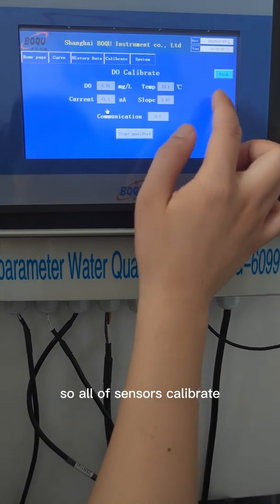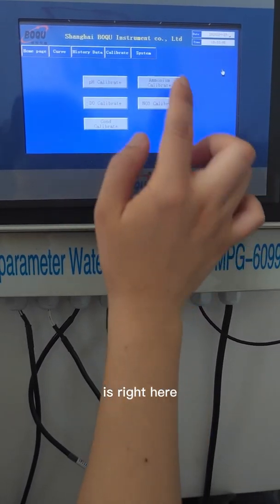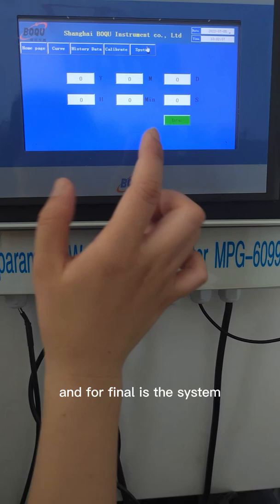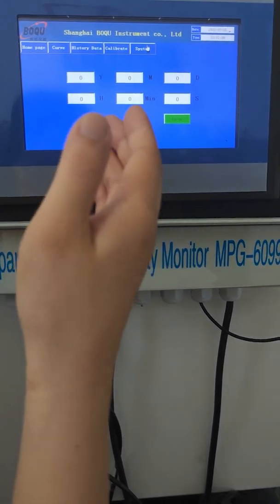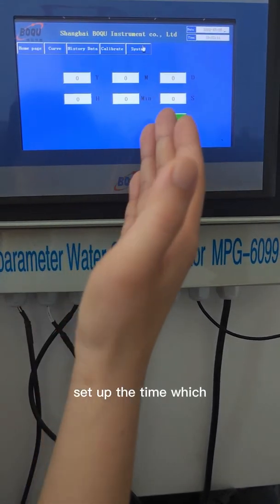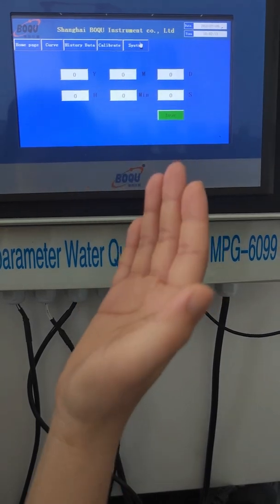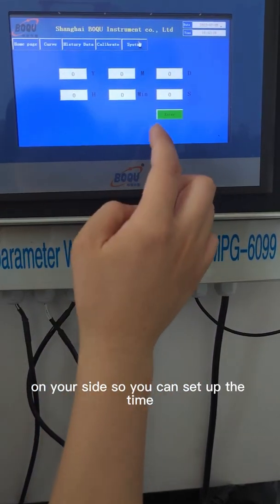For the final is the system. For this part we can set up the time which is on your side, so you can set up the time accordingly.